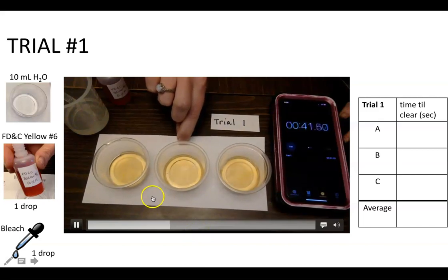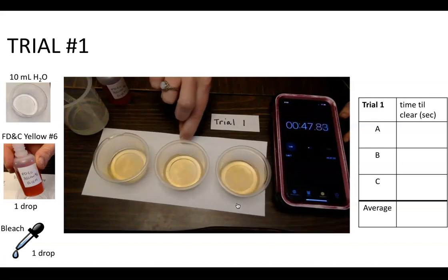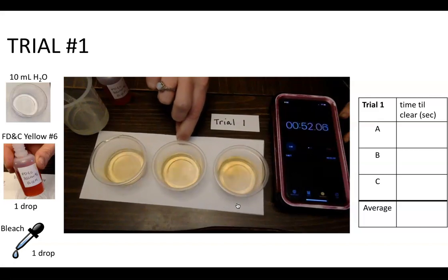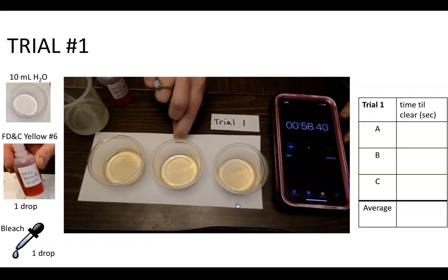They're fading. You can see they're turning like a paler orangish yellowish color. I need some background music. And they're getting even fainter.